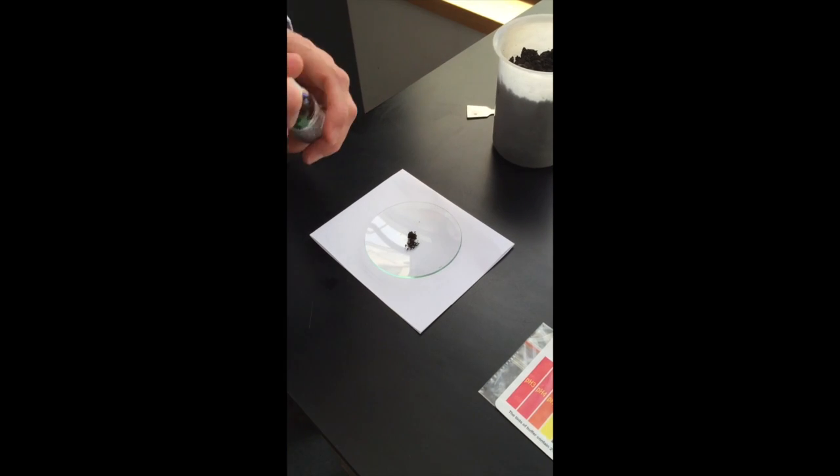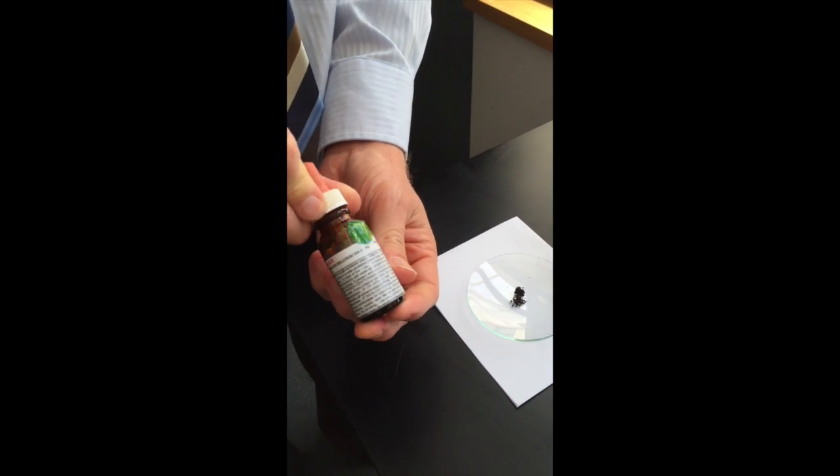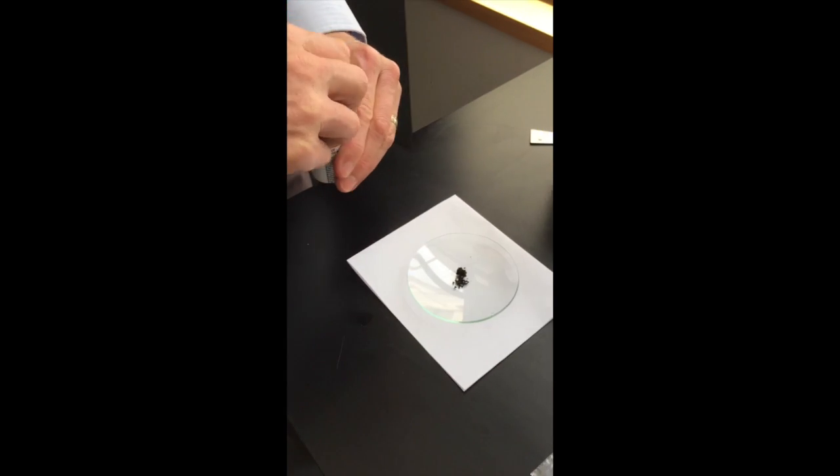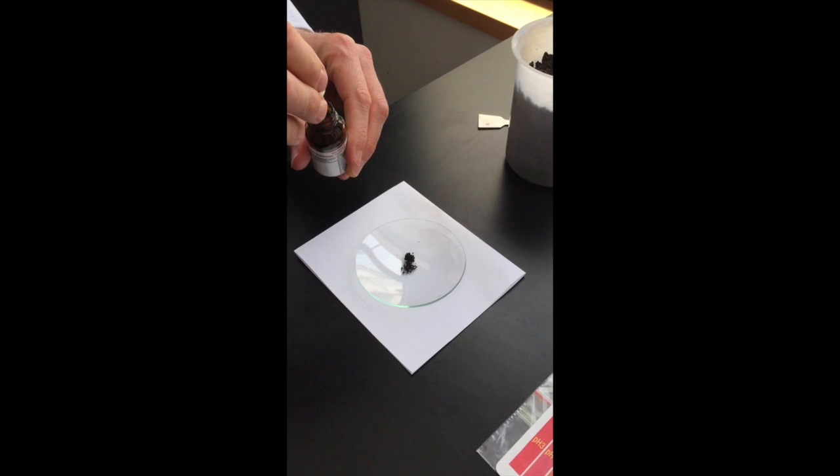The first thing you're going to do is get a little bit of soil and place it on a watch glass, then add a few drops of universal indicator to it just to moisten the soil.